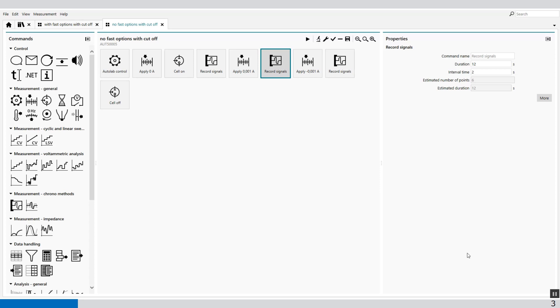This is particularly useful for long measurements on a cell that requires the options to be tested with a short interval time, for example, cutoff options or the derivative threshold.